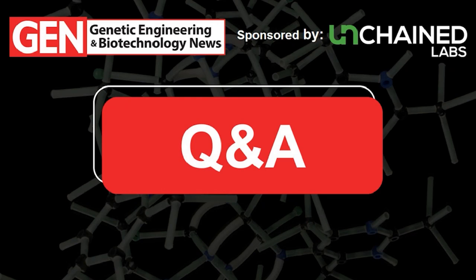So it's sort of a chicken and the egg. We have a method right now. Is it something comparable that can do something quickly? Perhaps not, but it will be important, I think, to at least understand what partials there are, whether it be the partial AAV vector or even the partials, including unintended packaging of genomic DNA.